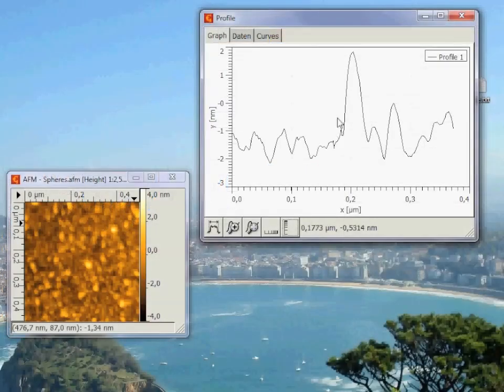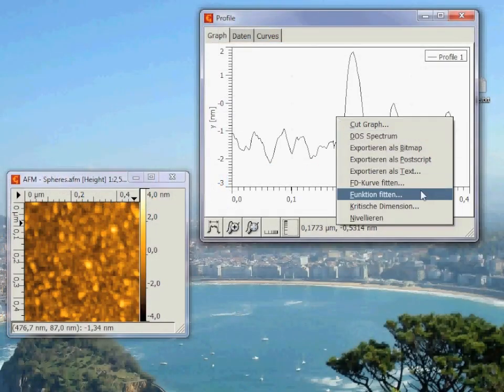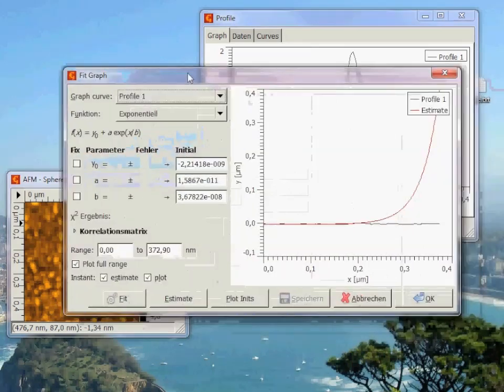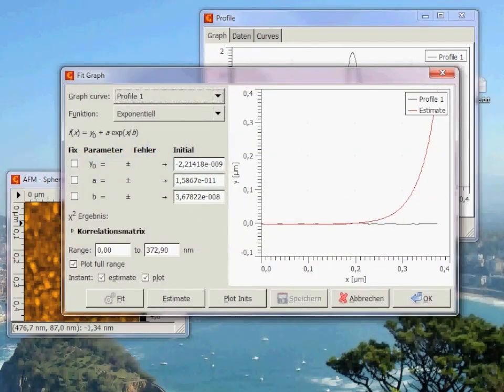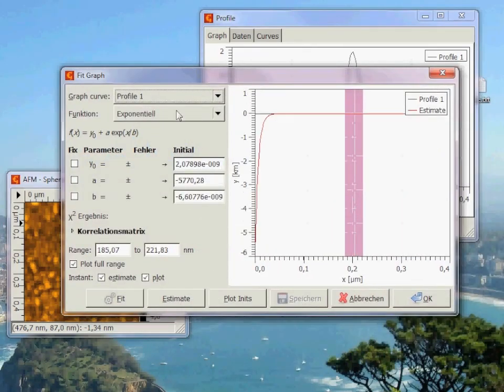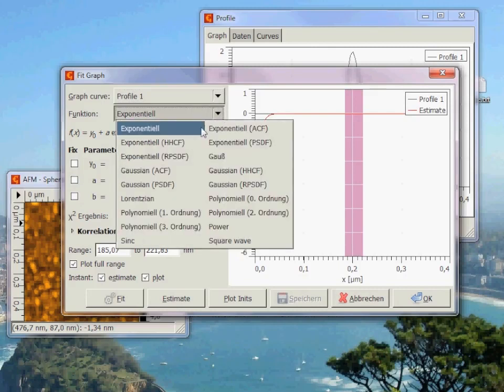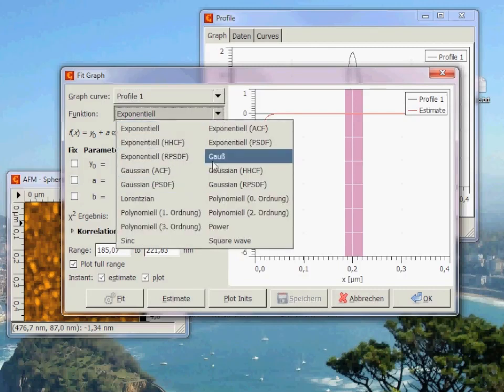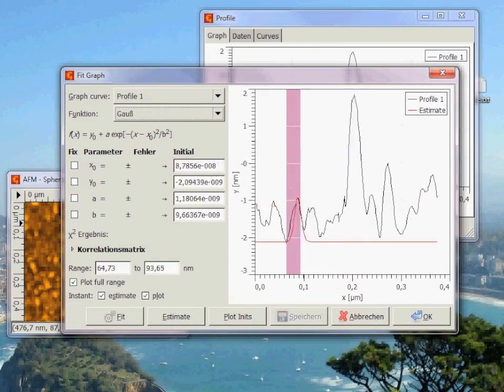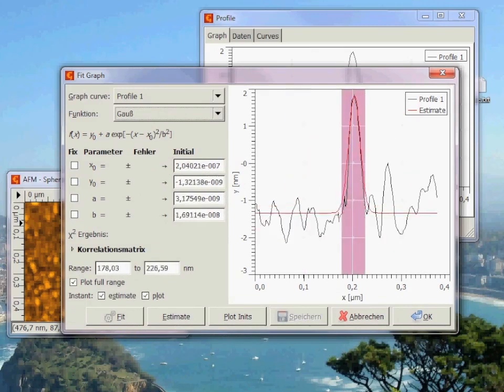Next thing, we will fit functions to the extracted profile. For that, click on Fit Function. In the new window, you can select the function to be fitted. For example, a Gaussian. Select the area where you want to fit the function and click on Fit.